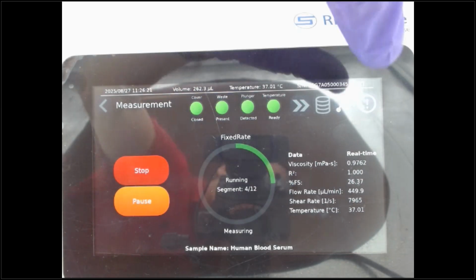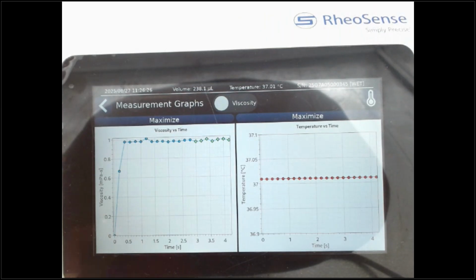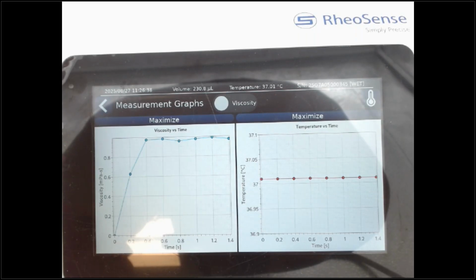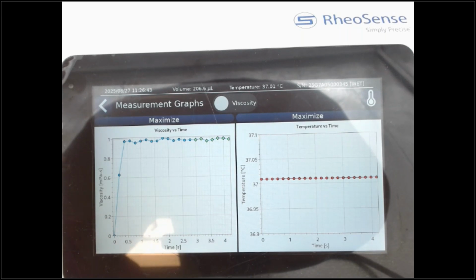And then if we click here on this plot icon, let's go ahead and do that. Cool. So we can see that it's showing here on the left, my favorite plot. I love it. It's the viscosity versus time plot. So this shows the measurements of viscosity of the sample as it's being pushed through the chip. So like a transient viscosity versus time.